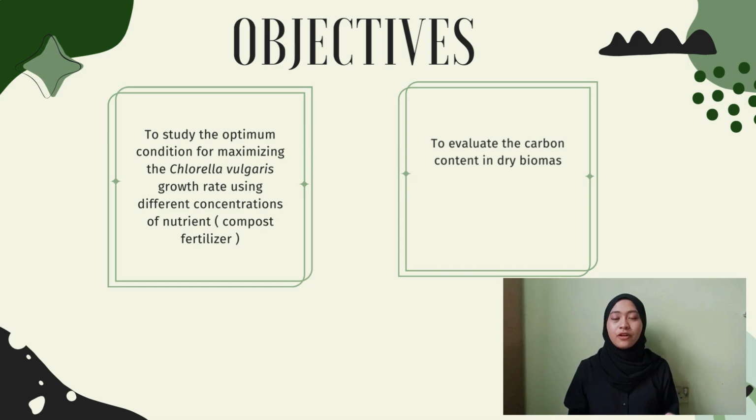Then we go to the objective. From this project, there are two objectives which are to study the optimum condition for maximizing Chlorella vulgaris growth rate using different concentrations of nutrients, which is compost fertilizers, and to evaluate the carbon content in dry biomass.